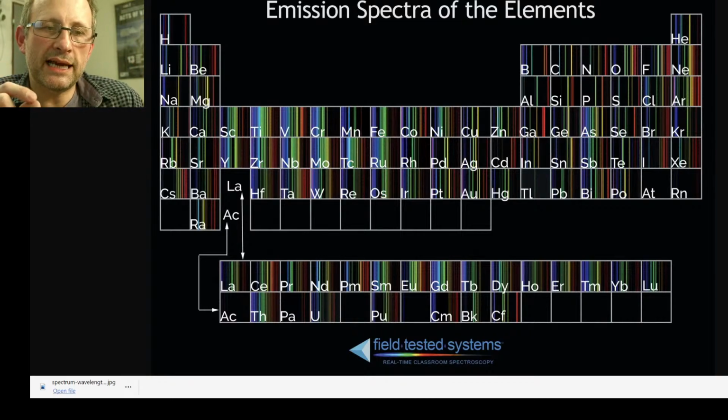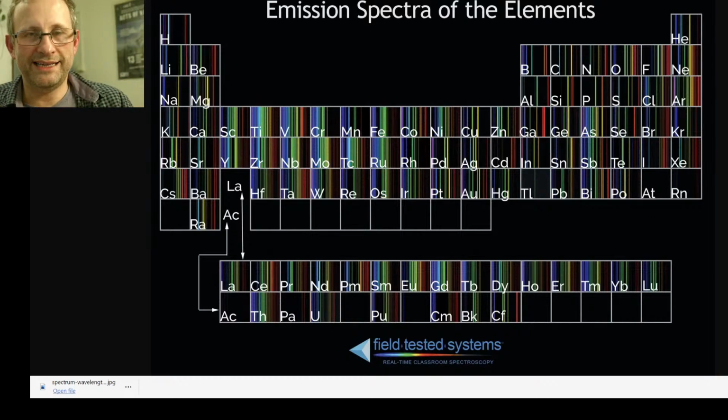The question is, do we see elements that should not be in there, and do we see specific elements occurring when we are running the reactor for a certain length of time, or when we are exciting it with a certain frequency or a certain intensity? Having the spectrometer looking into the reactor gives us some sort of metric of whether these elements are being synthesized. And in the past, we've put it on an ADS, and we've looked to see, are they being synthesized?